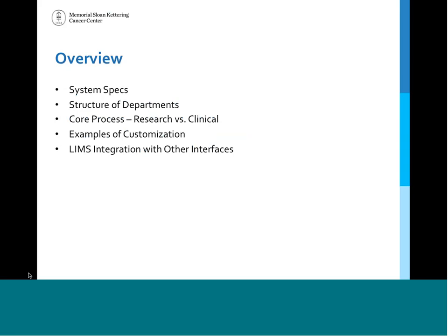And then lastly, I'm going to briefly review how the LIMS is integrated with a number of different interfaces across all of MSKCC and how we can both push information into the LIMS and receive it from the LIMS in a really streamlined fashion.